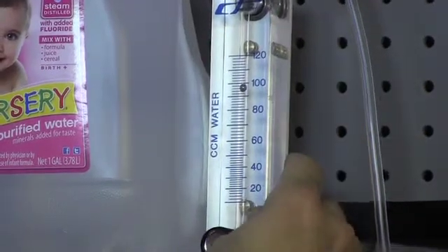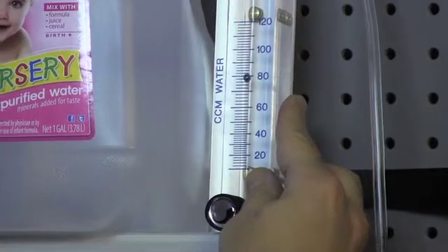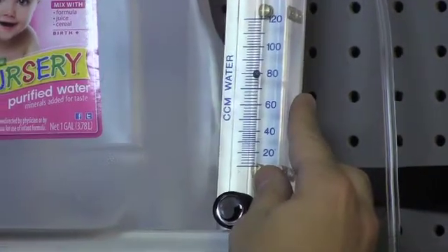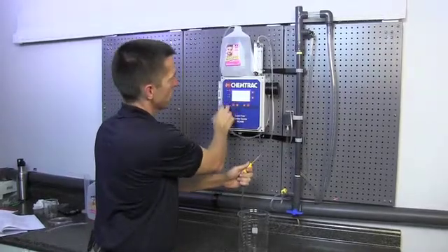Then we're going to slow the flow back down to that 75 milliliter per minute rate, which on this unit was right around 80 in the middle of the ball. Then we're going to let this count for a few cycles.